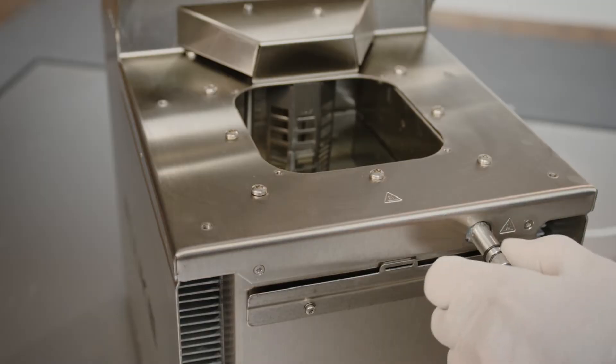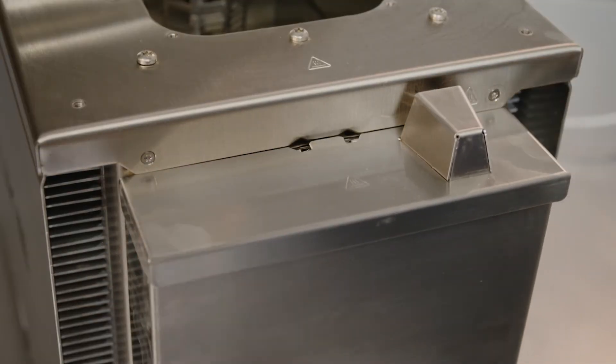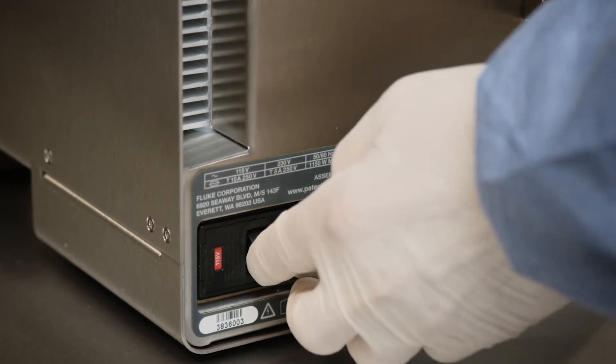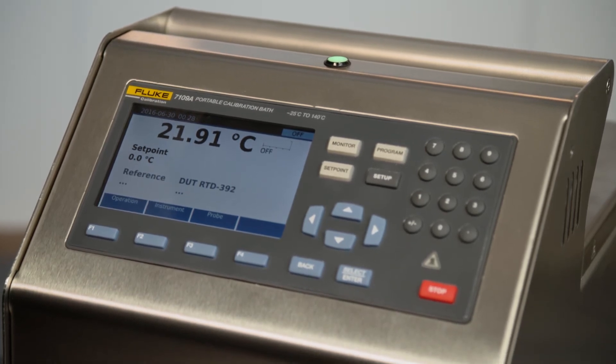If you're using the optional overflow kit, remove the cap of the overflow tube and install the overflow tank. Plug in the bath and power it on. In this example, we're using a 7109A process electronics as the thermometer readout.